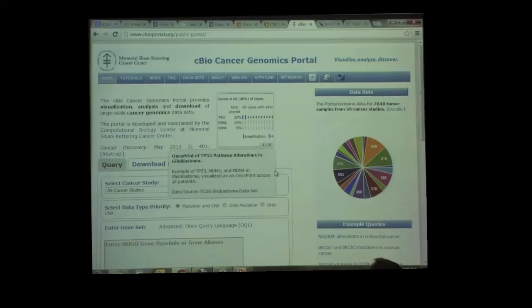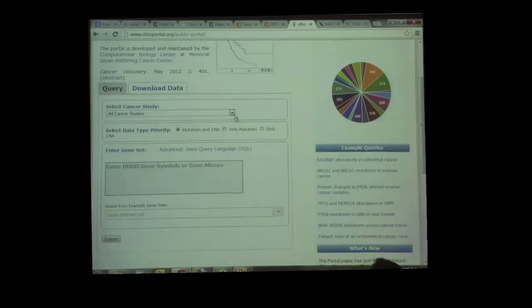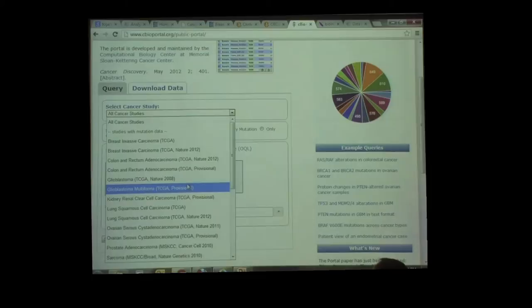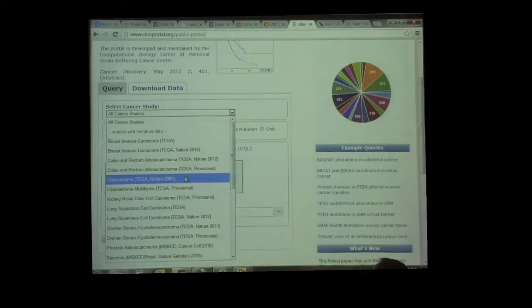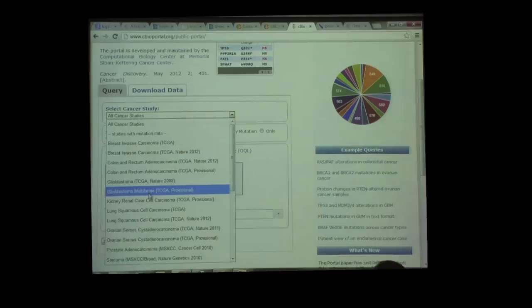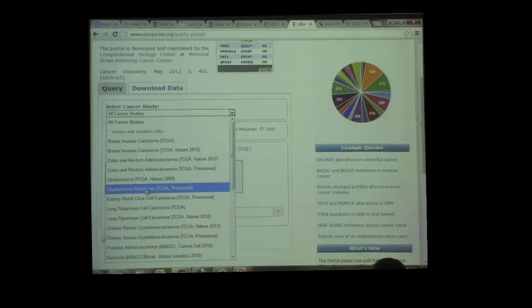This is the page that comes up. What we have here is you can select your study — when you click on the dropdown list, you'll see all the different tumor types available: breast cancer, colorectal cancer, glioblastoma, and so on. On some of them you'll have two entries — for example, glioblastoma — because TCGA has published marker papers for each tumor type. If you're looking at just the data from the marker paper, you click that link. The glioblastoma multiforme data from the marker paper was published in Nature in 2008. If you want all data uploaded to cBio in GBM, you click the second link which says TCGA provisional.